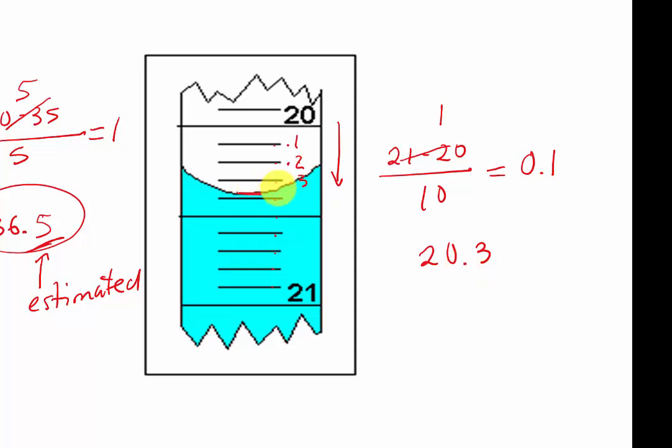As you can see, this is about half way of that increment, so you can say it is 5, because half of 1 is 0.5. In this case, it is the second decimal place. You'll see how we have to look at one digit individually and see how it is relative to the values of the single increment.